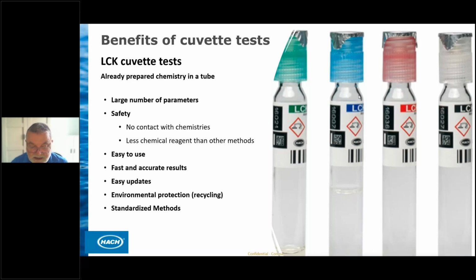This technique has many advantages that we will detail later, but we can summarize them as ease and safety of use, speed of analysis, and simplified waste management.